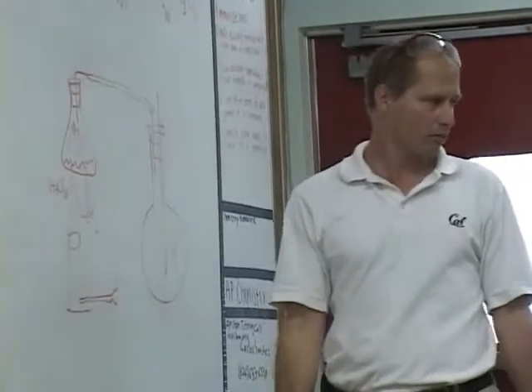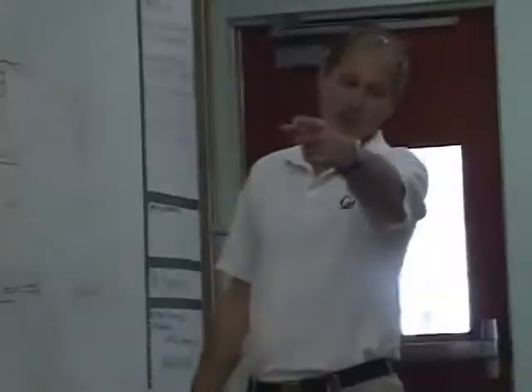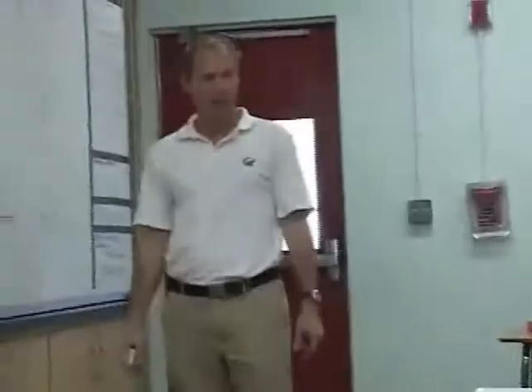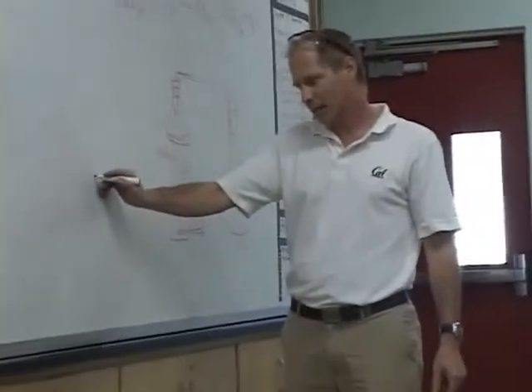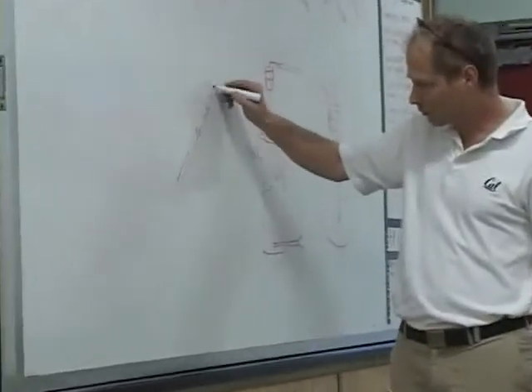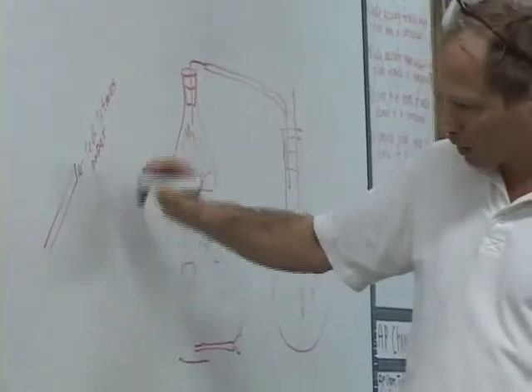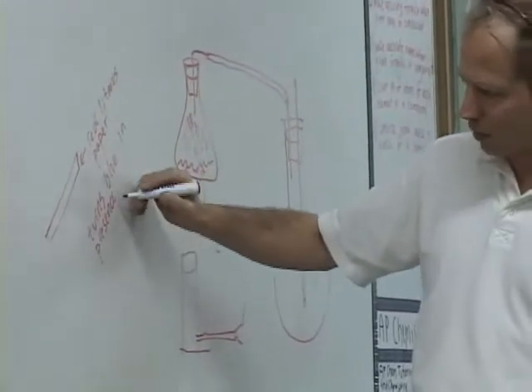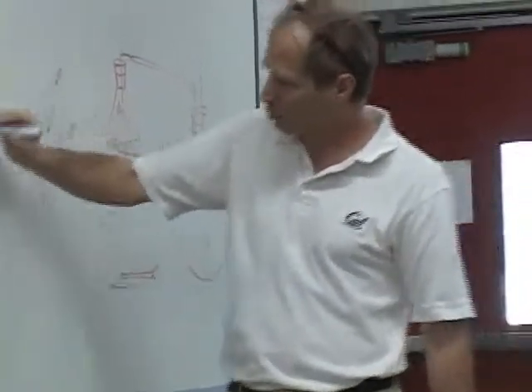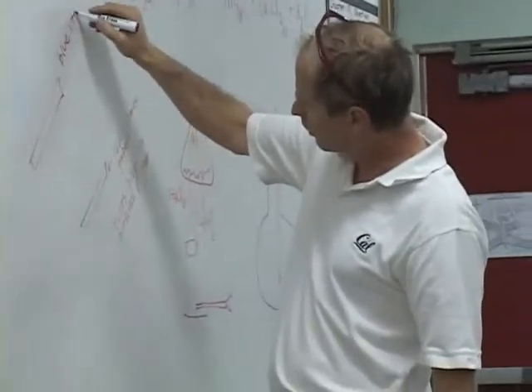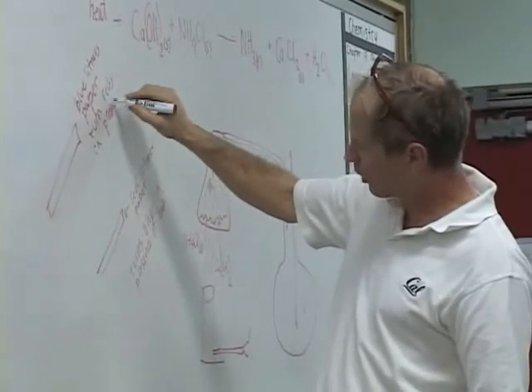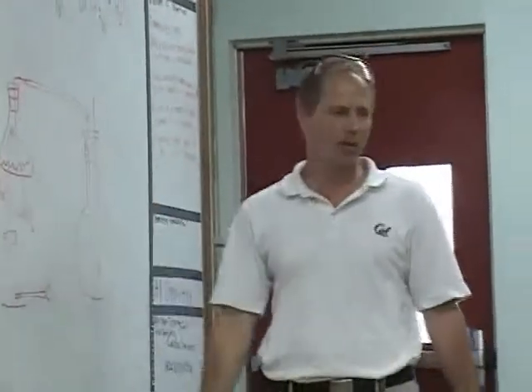What would be evidence of ammonia? Ammonia is very irritating to humans. I'm going to be preparing the ammonia gas in the fume hood. Ammonia — is it an acid or a base? It makes your hands slippery. I've got red litmus paper, and red litmus paper turns blue in the presence of a base. And there's blue litmus paper — blue litmus paper turns red in the presence of an acid. Which paper would be appropriate to test if it were indeed ammonia coming out of my flask? Red.